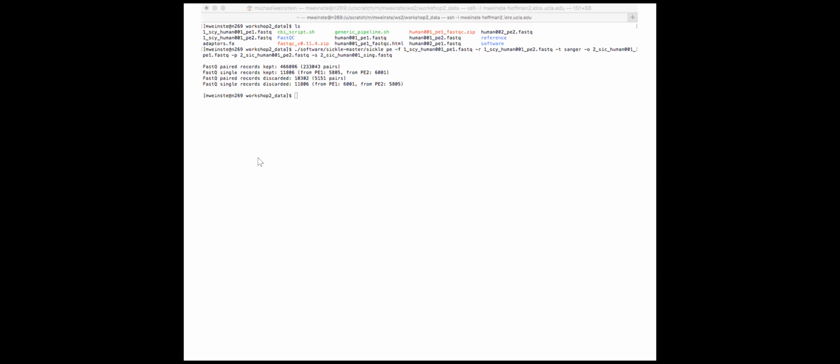All right. This should take a couple minutes to run. Can people put up hands if they've gotten this process completed so far? All right, I see a lot of hands going up, so I think this part's done. Awesome. Okay, so I can get us on to the next step.